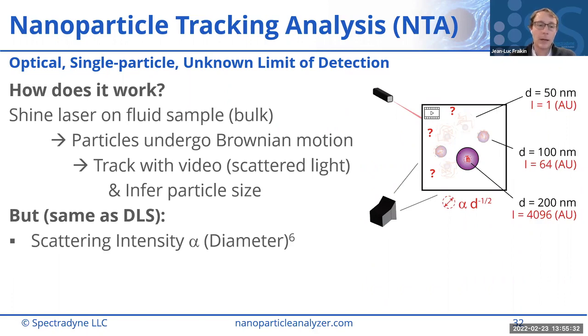Good question. So a lot of our customers use it to characterize protein aggregation, but not usually the dynamics of it. Usually they have a protein formulation, for example, a biologic, and they will stress the protein to different times or different limits, and then measure the particle concentration of aggregates at different time points after that.